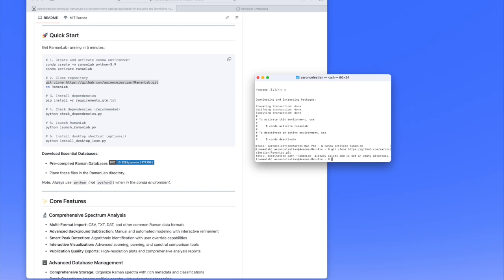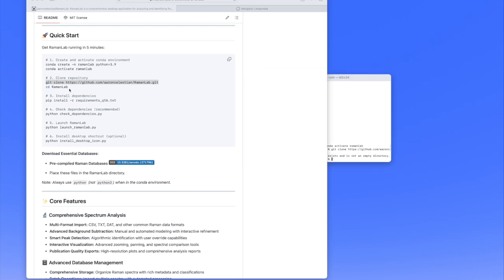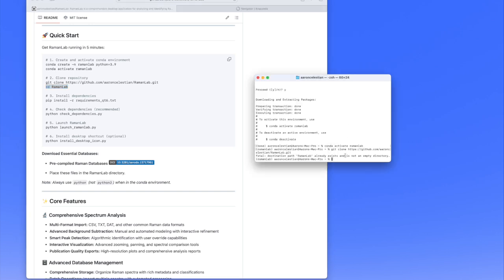Oh, that's because I've done it a bunch of times. So this will then install all the code that you want. It should just populate and you should see things coming in, but I've done it like 3 or 4 times already.